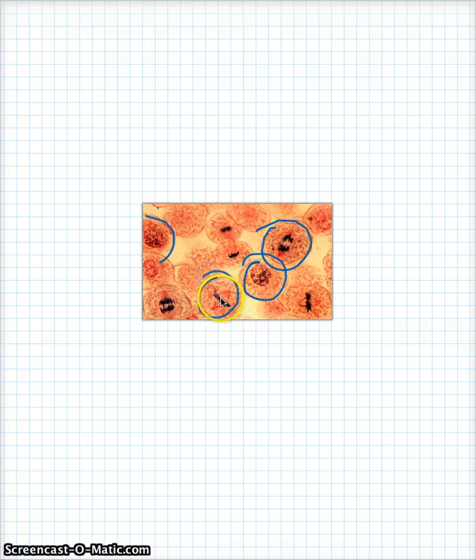All right, metaphase. Look at this really nice line. You can see the spindle fibers all on the sides here. I'm trying to kind of draw over them. This is early anaphase. It was just finishing metaphase, going into anaphase. Here's a metaphase. All right, and then this right here, telophase.